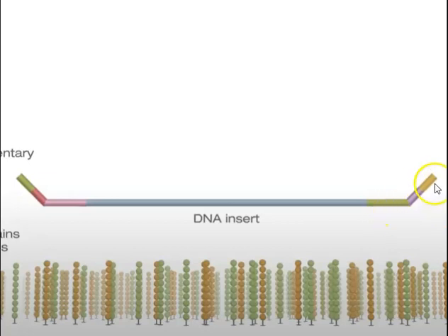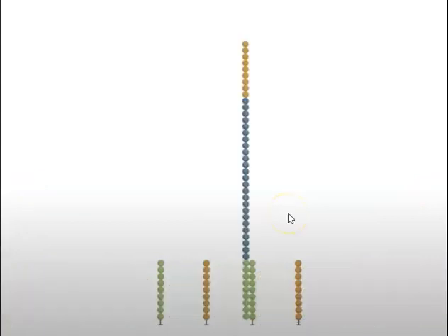And these oligos have several little parts to them. One bit is for binding the oligo or primer that's attached to the glass slide, and then you've got other sections to it. So it's much more complicated than just a capture probe. There are various different parts to it, which we'll see later on in the video. So we can see at this point, one of the oligos on the end of the DNA for sequencing has been captured by one of the oligos on the flow cell.